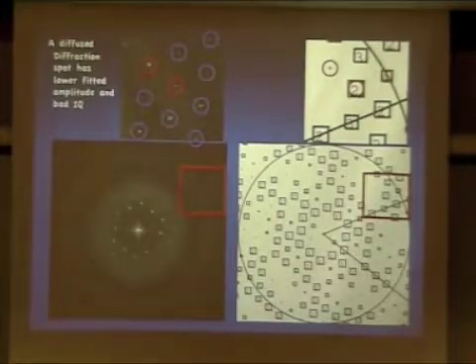So whatever is outside of it is not contributing to your overall integration or your phase determination. And that also comes from a distortion. So what we will be doing in unbending is trying to sharpen things like this up in order for you to be able to have that information considered as part of the crystal. Okay? Make sense now?